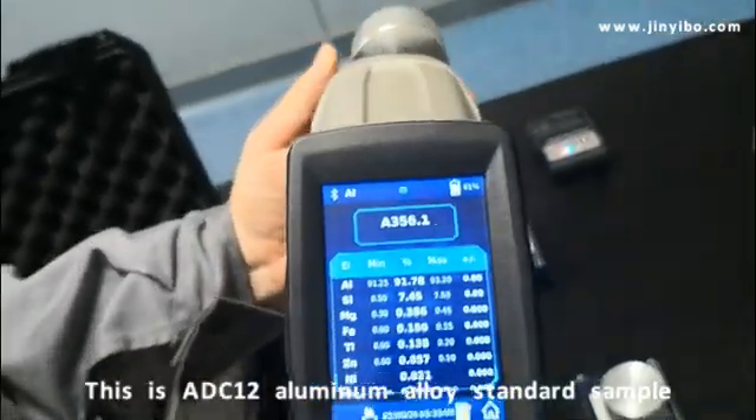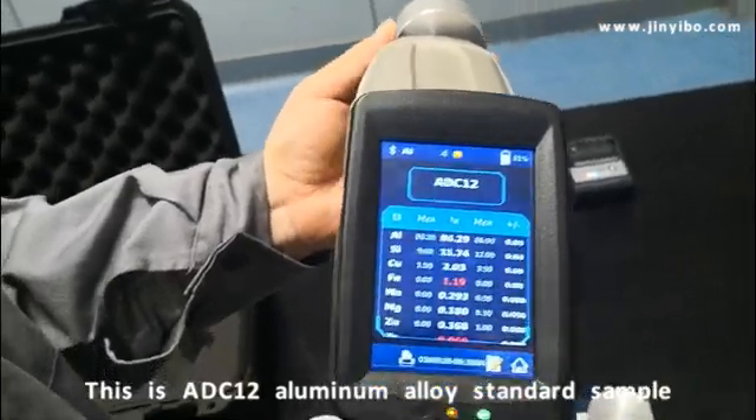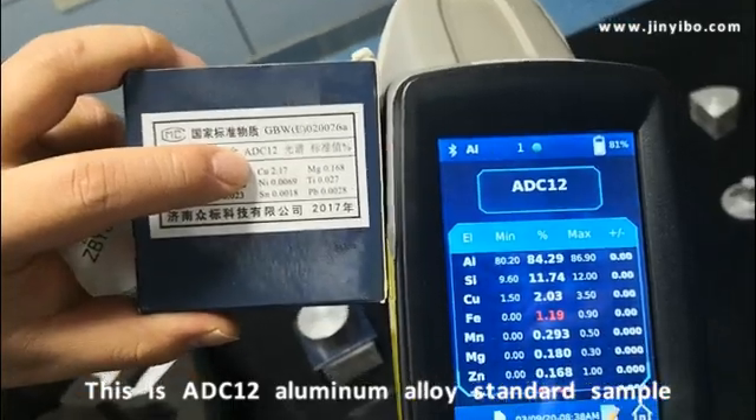Change to this sample. This is ADC12 — let me confirm — this is ADC12.